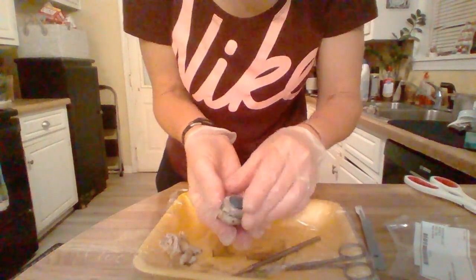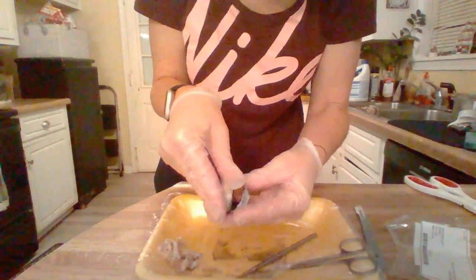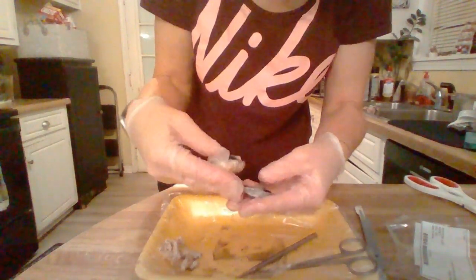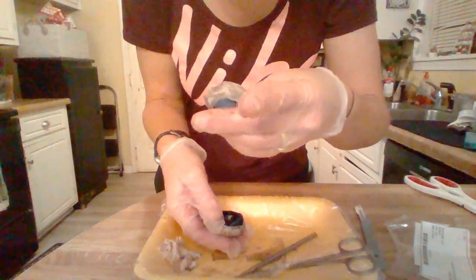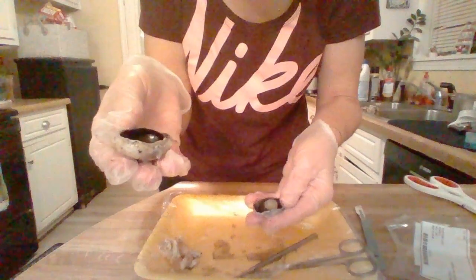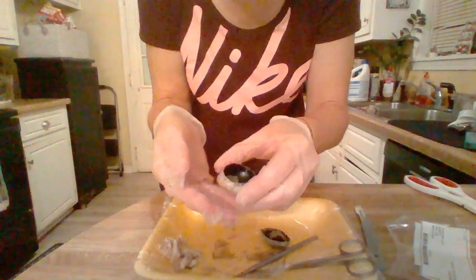When I cut into this, we had the two different cavities. This is the anterior cavity, and here's the posterior cavity. So let's look first at the posterior cavity.